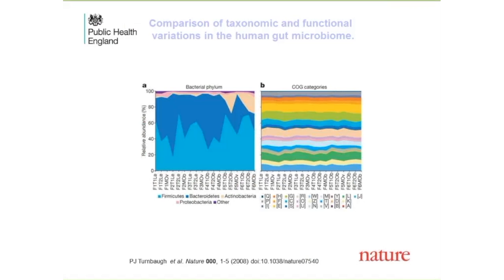For reason of timing, I think what I will do is jump these 3 slides, forgive me, but to show you that on this slide here, these are the bacterial flora that were analyzed and compared in 2008 between various samples from the human gut microbiome. And these indicate exactly the same variation that I've shown you in our sets of slides from 2016.